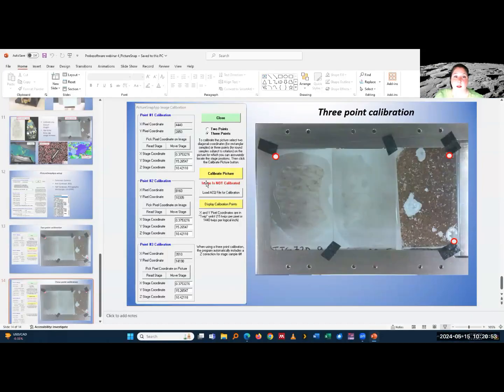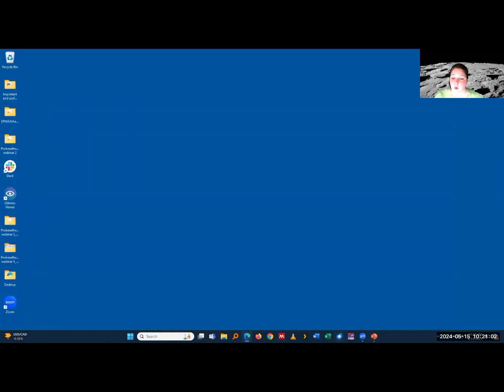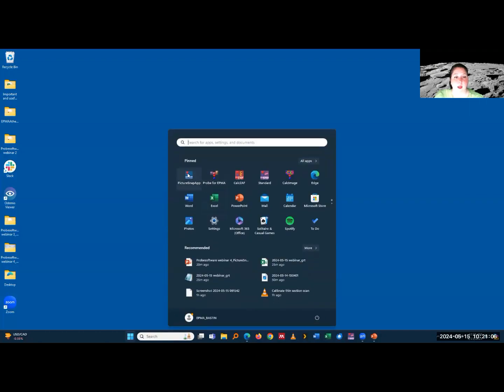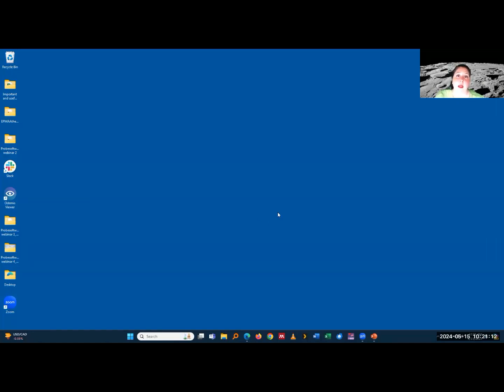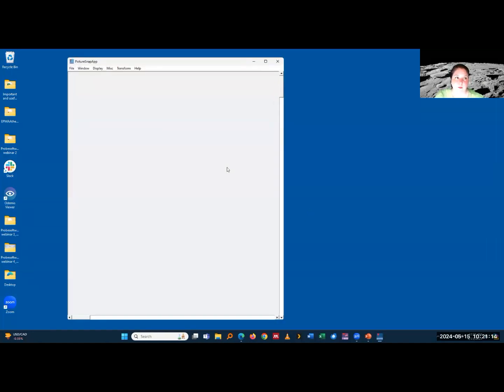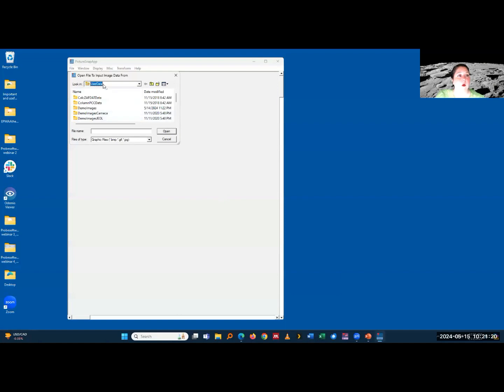So that's the manual way. But I can tell you that there's actually a nice little trick that I want to show you that is much easier to do. It makes use of the fact that if you have a well set up camera system, it can be very simple and very quickly done, and no one wants to waste time in the morning.